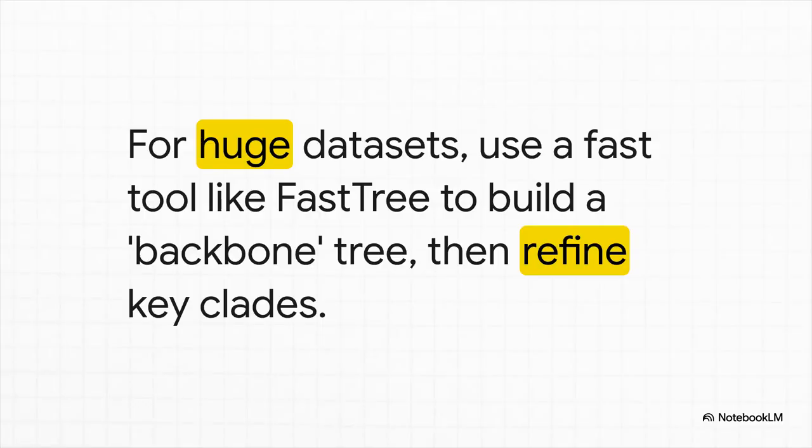So how on earth do you deal with those massive, ultra-large data sets? Well, the smart play is to use a 2-step approach. First, you grab a really, really fast tool, something like FastTree, to build a quick and dirty backbone topology of the whole thing.